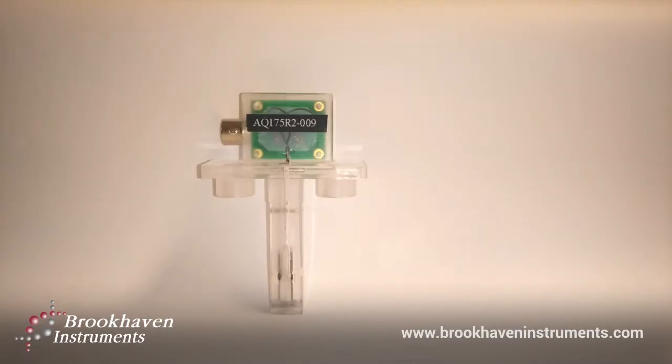This electrode is perfect for measuring the zeta potential of precious samples, as it only requires 175 microliters of dilute sample. This electrode can also measure high salinity samples with ease.